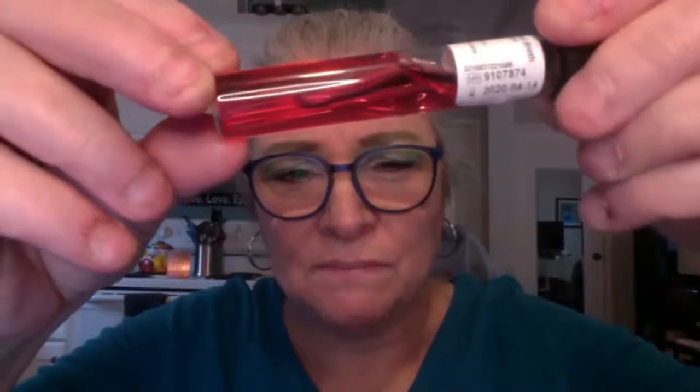But I just want to point out to you, just as a little trick of the trade, sometimes when you buy this media, it gets jostled around a little bit while it's in shipment. And sometimes it'll arrive like this. Let me see if I can get you to see this. There's a big bubble in that Durham tube. Can you see it? Compare that one to this one. So if you're going to use the media, you've got to get that bubble out before you inoculate the tube.